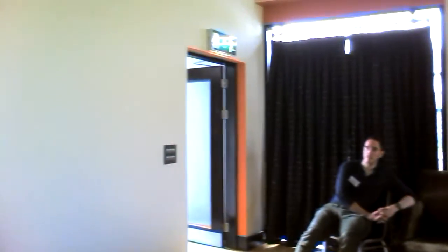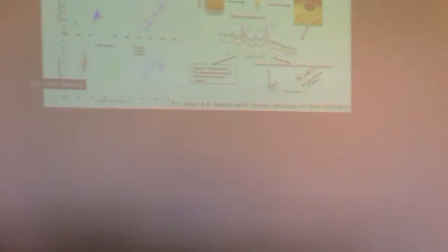Yeah, so when you're getting that scale, you're just... I guess, do you have a comment on that? How far are we away from that? I think we are quite far. For urea, we're 2 or 3 orders of magnitude away. If I wanted to do it, I'd probably go to something like stimulated Raman, but then the real estate for a laser is too big, or the technology, we just don't have that, and I've got too many other things to do to get invested in that at the moment. So I think it's just really hard to get down to that.